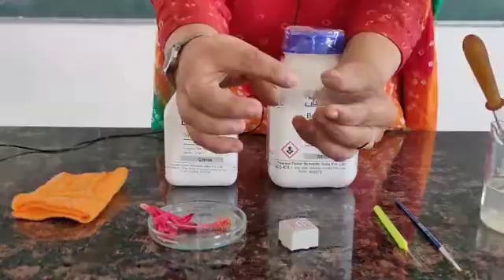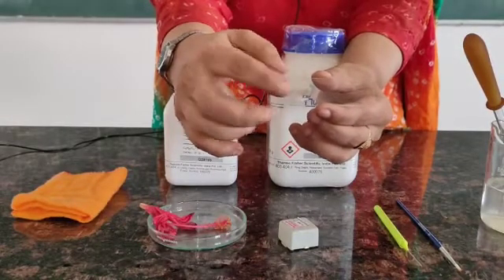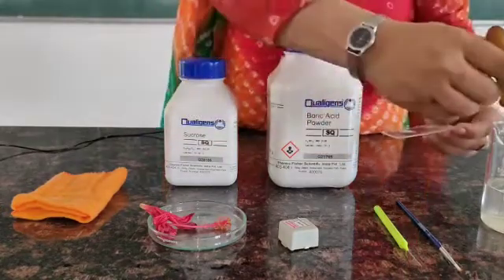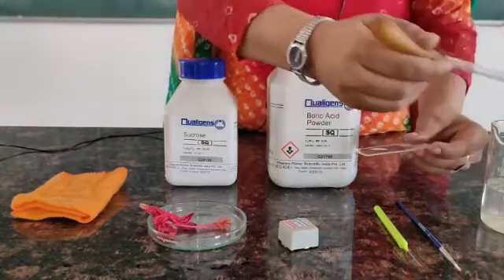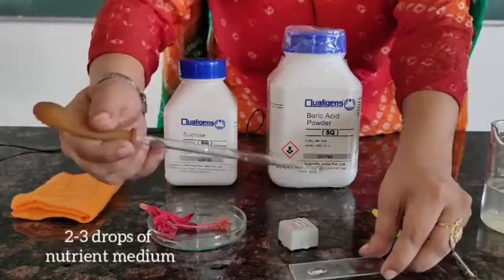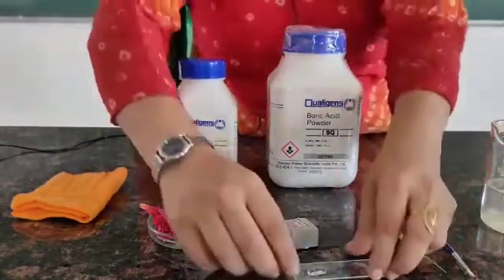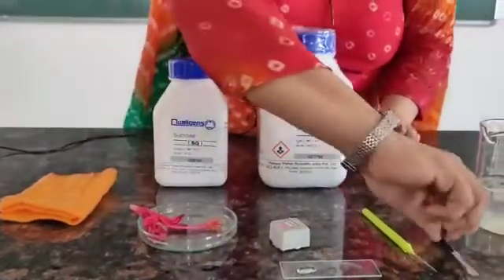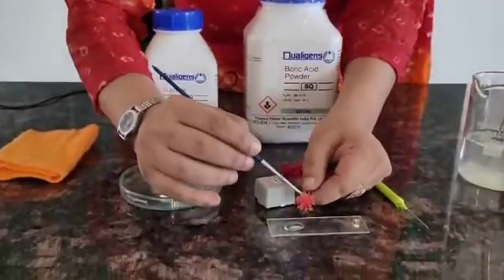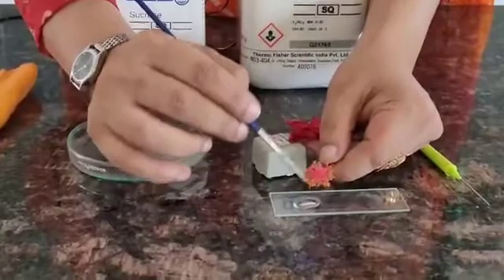You can see there is a concavity in the cavity slide — a depression wherein we are going to put our nutrient medium. With the help of a dropper, we put 2–3 drops of the nutrient medium in the depression. With the help of the brush, we dust the pollen grains over the nutrient medium.